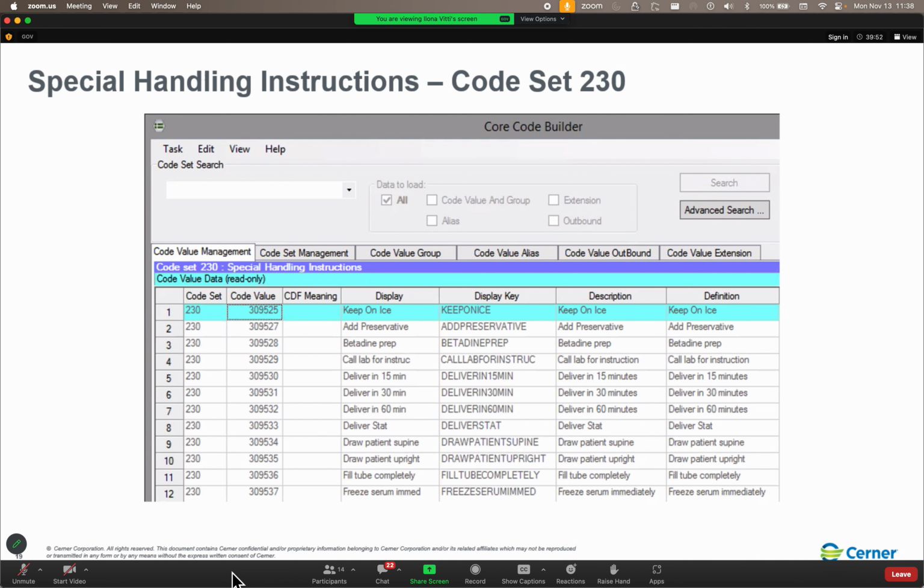And then we put in the code set number. Now, if you go to the when to cycle servers reference page, the only place server 49, which is our code cache server, is mentioned is right up at the top. Nowhere else on that page is it mentioned.